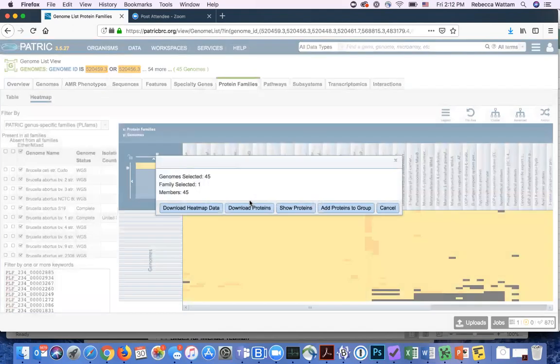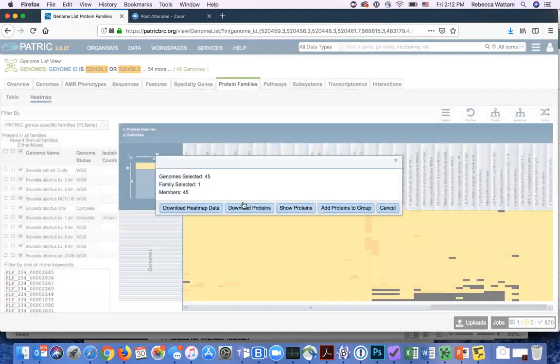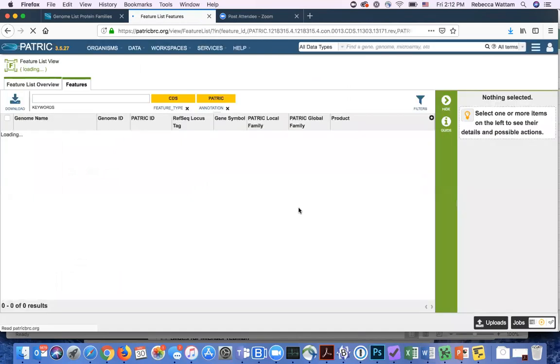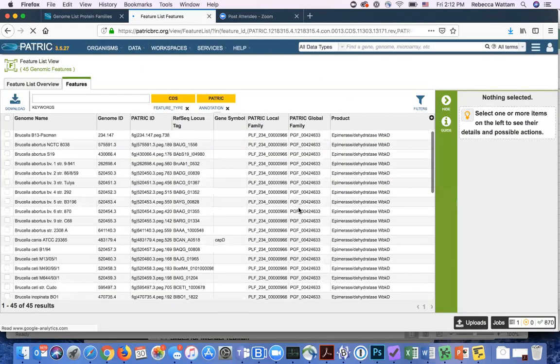We have to wait and there are a number of things that we can do, but I want to show those proteins. I could also add them to a group, but let's click the show those proteins button and it shows me all the information about all the genes that are there.